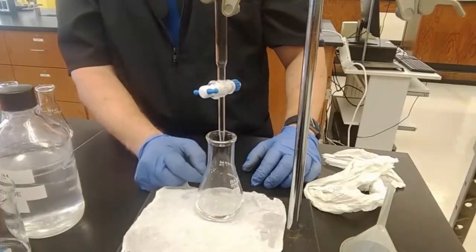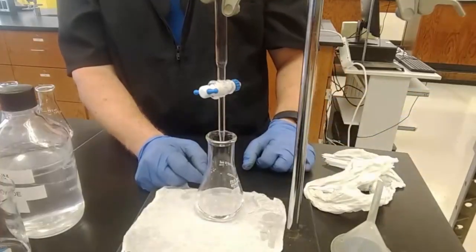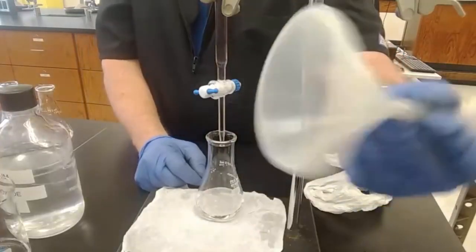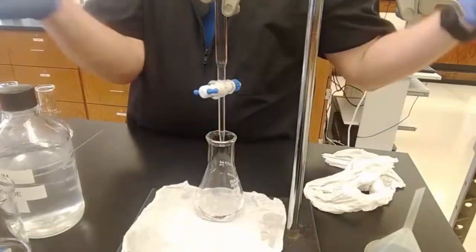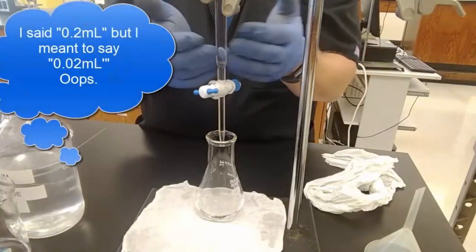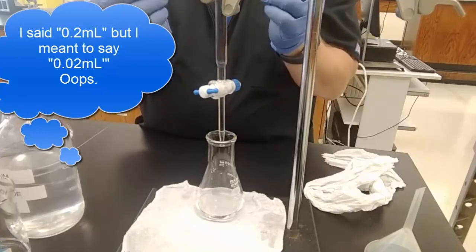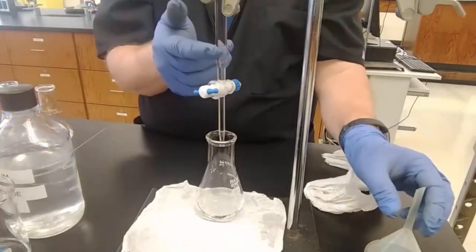All right, it says in step 10, there's a question first: why is it good lab technique to remove the funnel? I took the funnel out after I filled it to 3.00 milliliters. How come I took it out? Well, because if there's a drip or something in the funnel and it drips down into my burette as I'm titrating, I just trashed the whole point of using a burette. Remember, plus or minus 0.02 milliliters, and a drop, at 20 drops per milliliter, is 0.05 of a milliliter. You're trashing your precision. There's no reason to do that. So take the funnel out so it doesn't drip in.